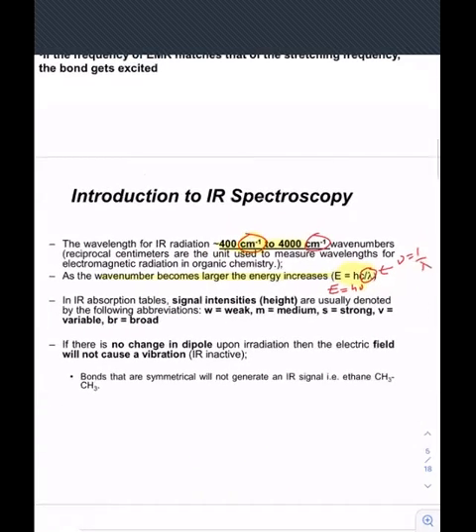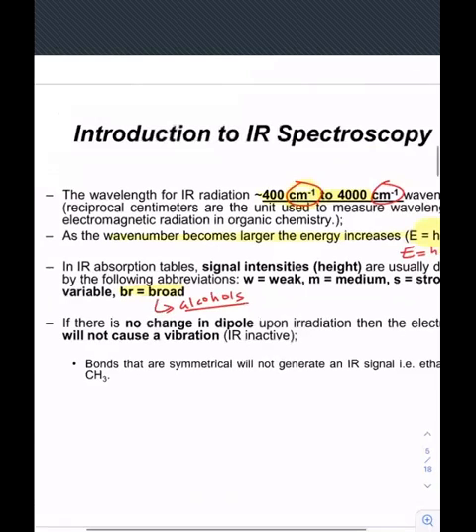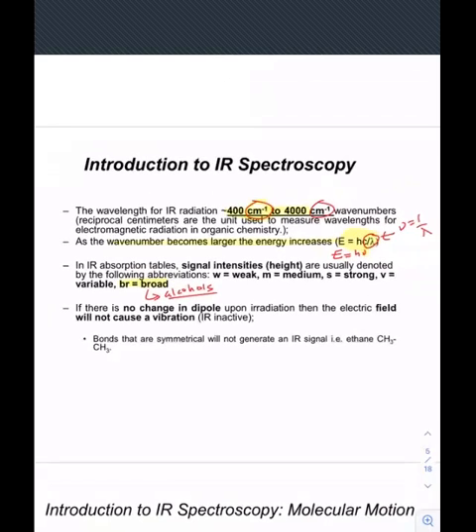So in the infrared, you have different intensities. You have weak intensities, medium, strong, variable, and broad. When you see broad intensity stretches, that's indicative of like an OH functional group, right? It's a very distinctive stretch, and it shows up in a specific region on that spectrum. But you also can have medium, strong stretches, variable stretches. It just depends on what the functional group is. And if it's a really strong stretch, you're going to see a really strong downward spike, right?